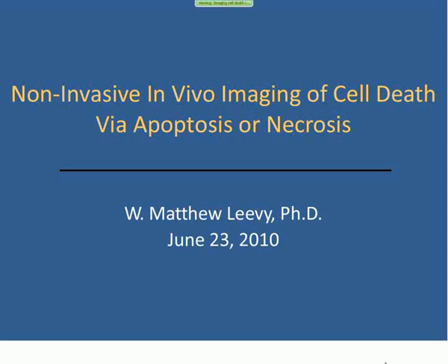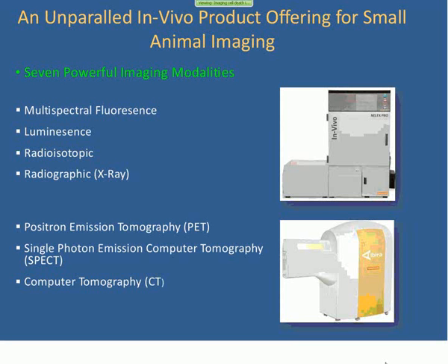About 2 years ago, I was a full-time employee of Carestream Health, and for the last 2 years, I have managed an in-vivo imaging core facility at a university in northern Indiana. So every once in a while, I like to take off my academic hat and put back on my Carestream hat and discuss some of their technology and applications with customers. And so today we're going to talk about the specific application of imaging cell death mediated by apoptosis or necrosis in living models.